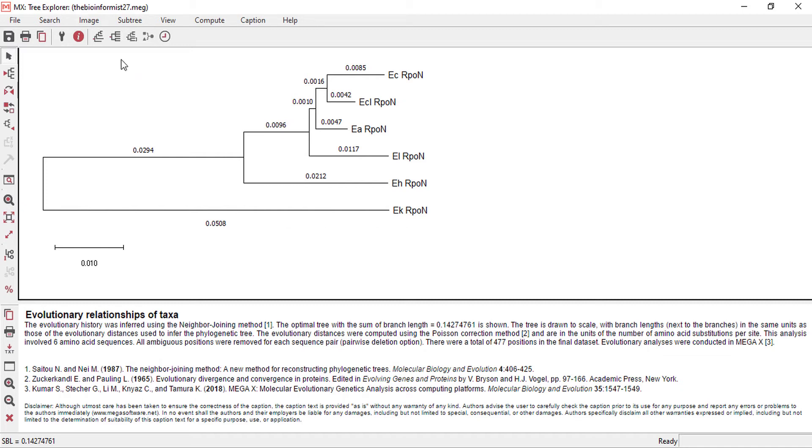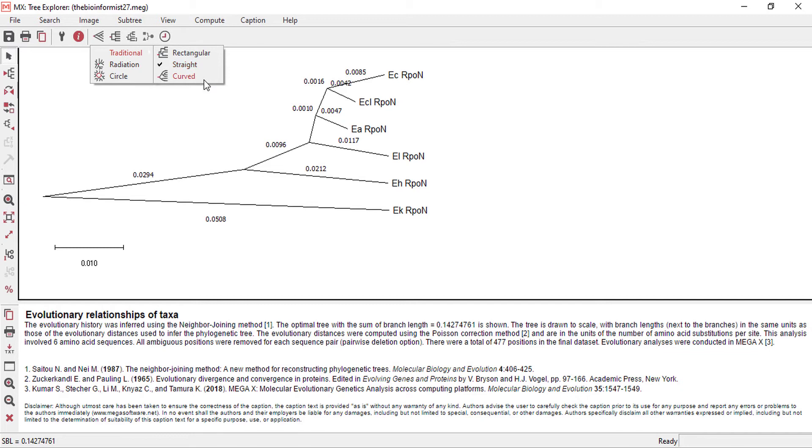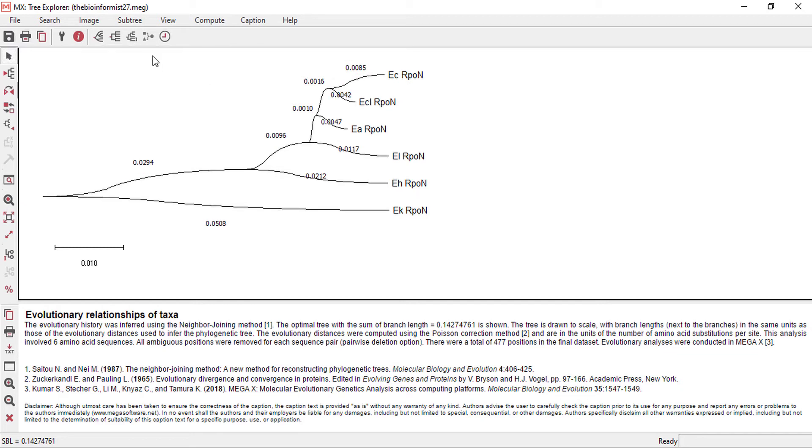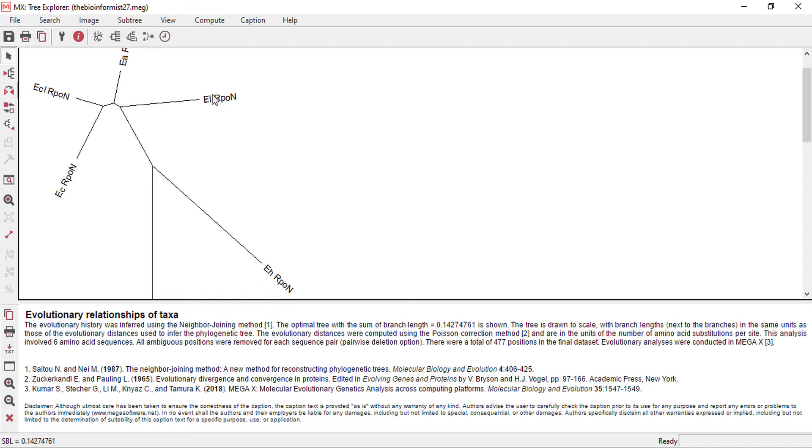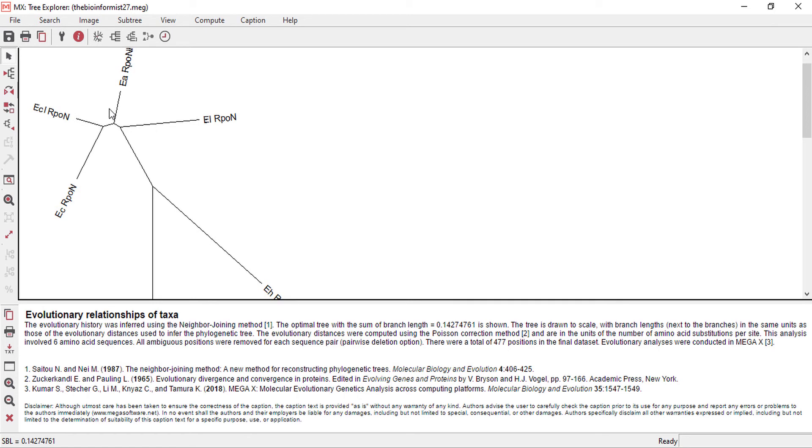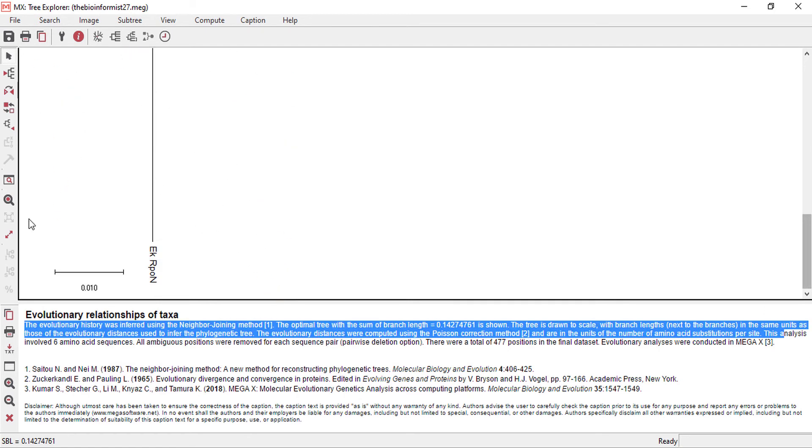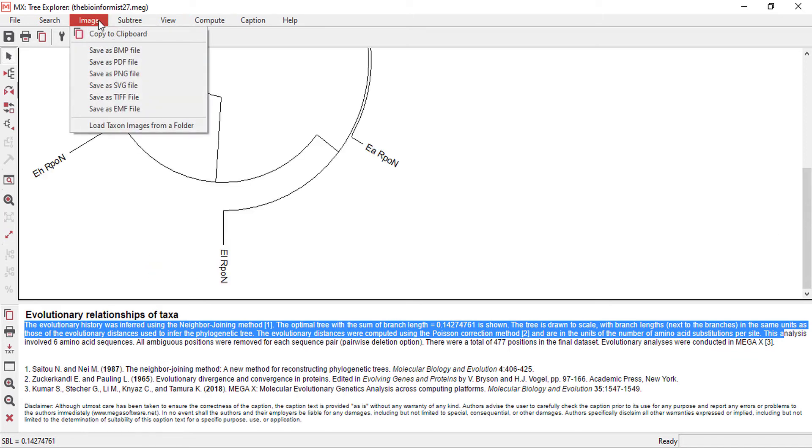We can change it into straight or curved. Also, we can use radiation or cycle tree. We can see this is the close one, and this protein over here is the distant relationship. It is the outgroup. One thing that we can do is save this as PDF file, BMP file, or PNG file.